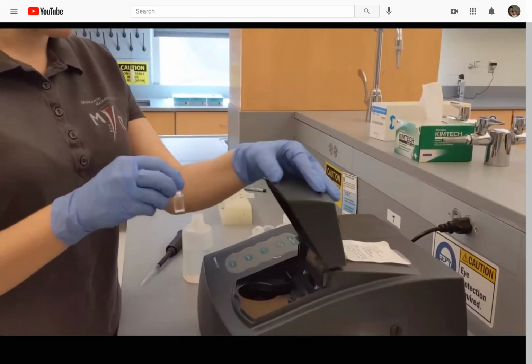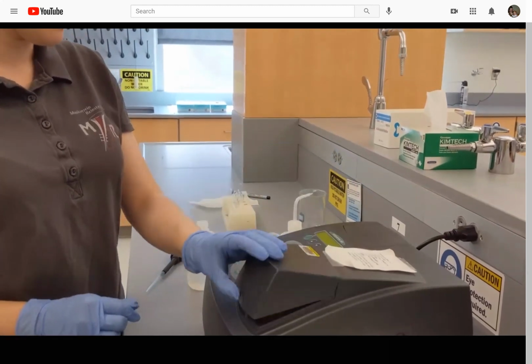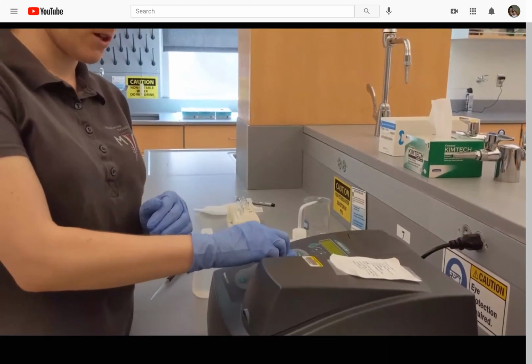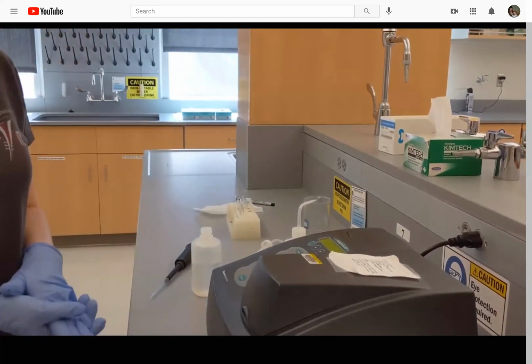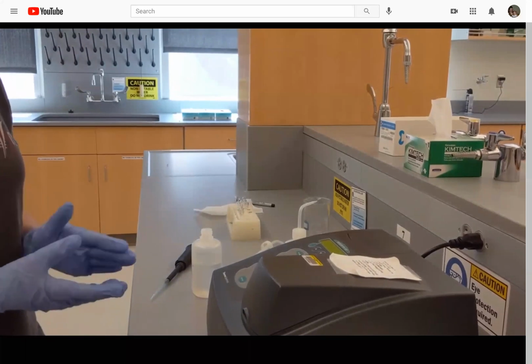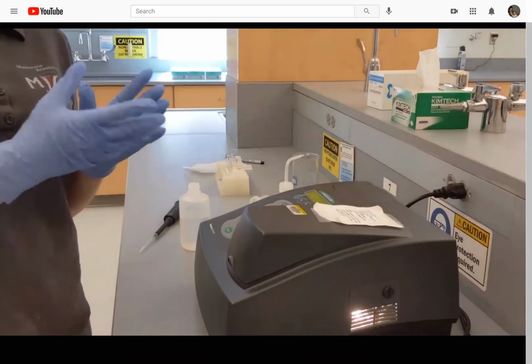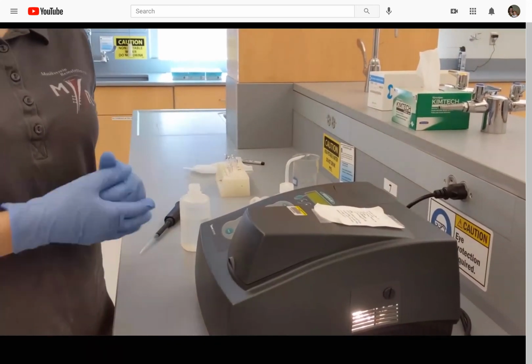All right, so I'm now going to insert my cuvette with my DI water, close the lid, and press the 0 absorbance button, and that's going to blank our instrument, essentially telling it to negate the absorbance that it's reading for the DI water. So that won't affect our future measurements.